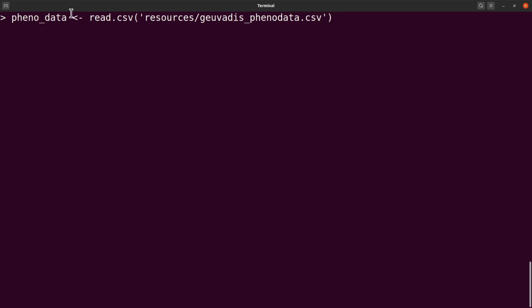In some tutorials, you see double quotes here and then here. That's also accepted because we are dealing with characters. I also use this tutorial to explain a couple of things to people who may be beginners so that you understand the R syntax. Okay, so let's run this command. Okay, so the information has been loaded.